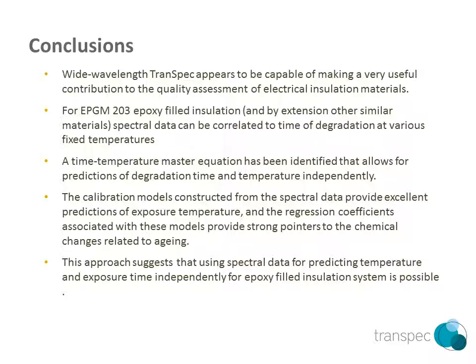The conclusion from this type of research and development material assessment application gave a number of useful conclusions. That wide wavelength could be used to assess the quality of electrical insulation material. These epoxy-filled insulation materials can be correlated to time of degradation at fixed temperatures, or time and temperature independently, and the calibration models provide excellent predictions. This gives information on what type of chemistries are going on in degradation, as well as ways of tracking them. This approach could be used on a variety of materials.